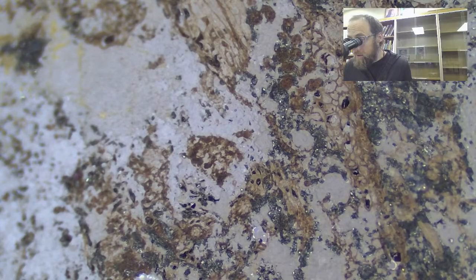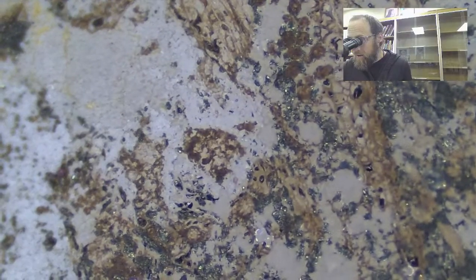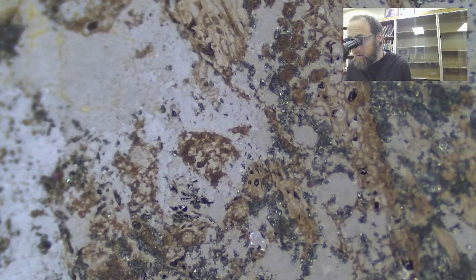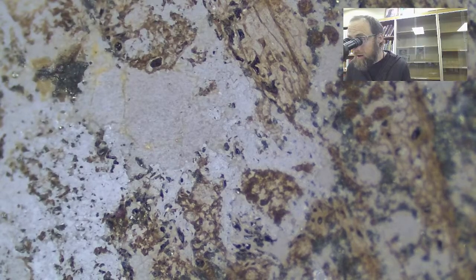And then, kind of, well, actually, let me look at this. I'm always trying to, with some skepticism, look for evidence, actual evidence of creatures. So now I'm looking for anything that will resemble also the globs of material that make me think coprolite.